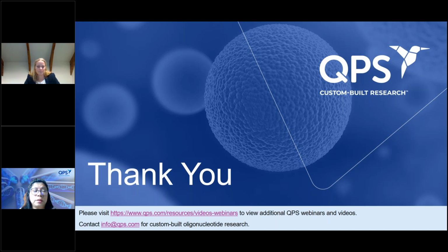Got you. And how long does method development typically take for hybridization ELISAs in comparison to traditional ELISAs? So it doesn't take too much longer. With a traditional ELISA, you most of the time have all your reagents in house. With the oligo method development, you need a few extra days to test the different combinations of oligonucleotides to get the optimal binding. So regarding that, it's only a couple of days.